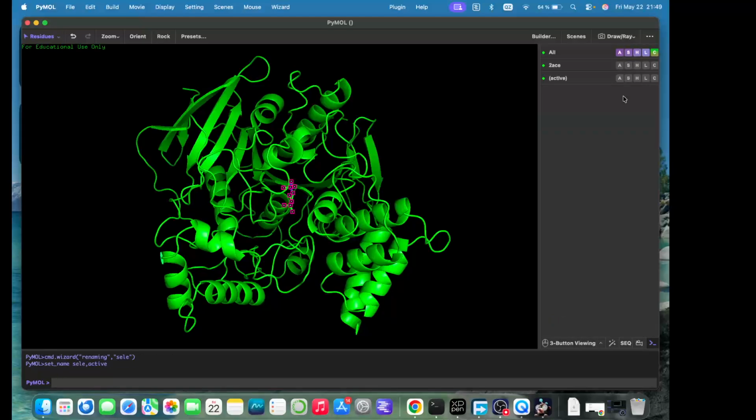Normally the hydrogen bonds, the van der Waals and the ionic bonds have different diameters. Hydrogen has around 2.8 to 3.2 angstrom diameter, and ionic and van der Waals has around 3.8 to 4.2.